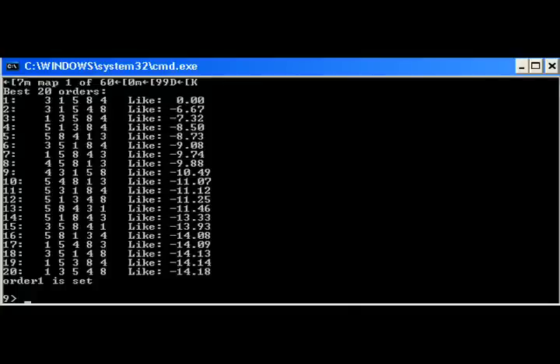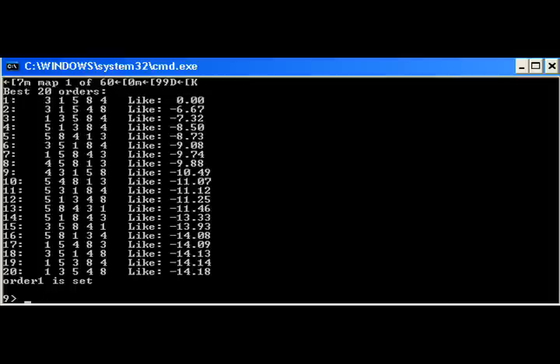The compare command instructs the program to look at all possible orders and return the order and the associated LOD values. The sequences are given in the best possible order. Because the LOD value is a logarithmic value, the 3-1-4-5-8 order is 10 power 6.67 times more likely than the next order. Clearly the first order is the best order.